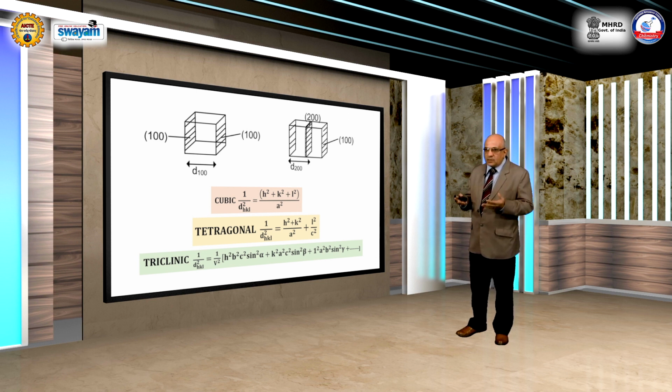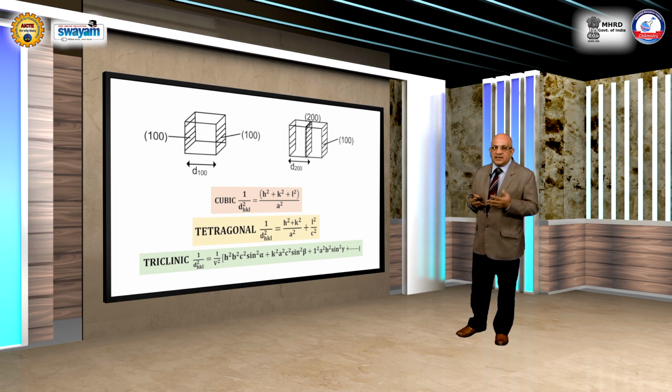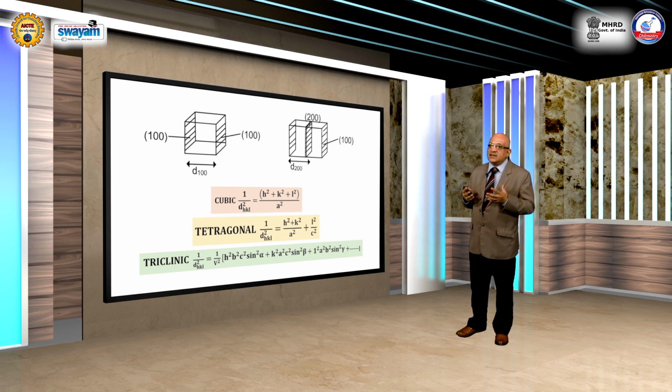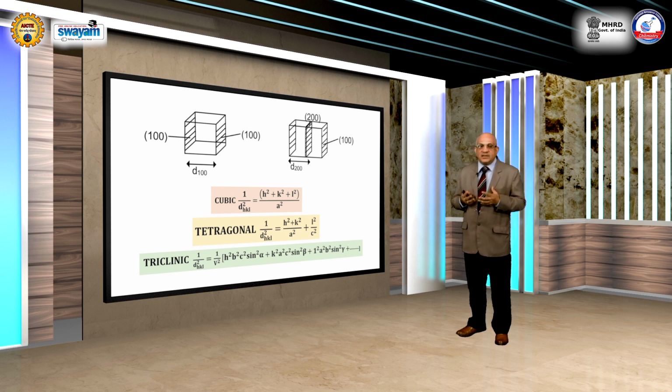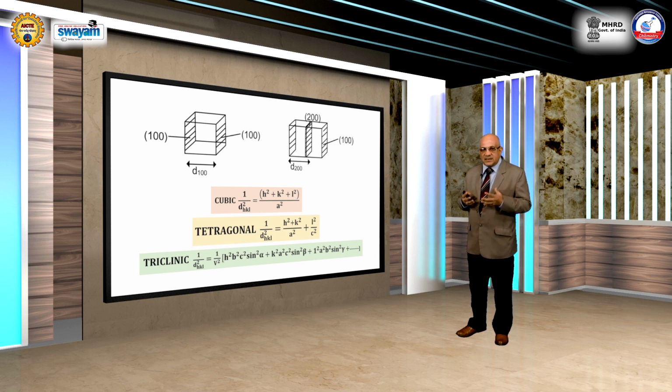So, if known materials are there and the database is with us, we can compare, and even from a mixture of three materials we can identify what the three materials are, and from the intensity of the reflections we can semi-quantitatively also tell how much of each material is present in the mixture. So, there the intensity of the reflections will become important.